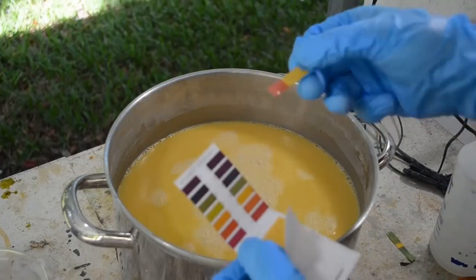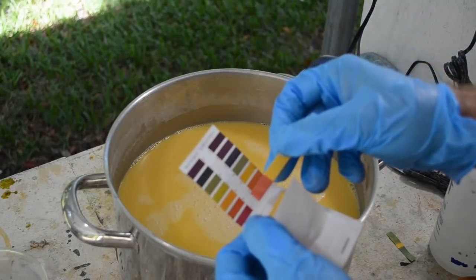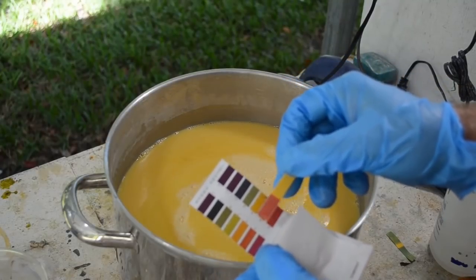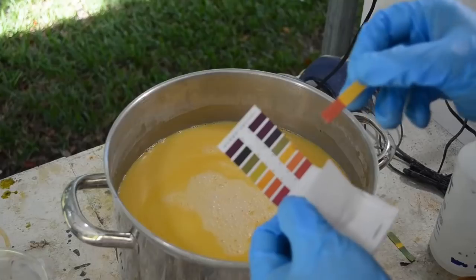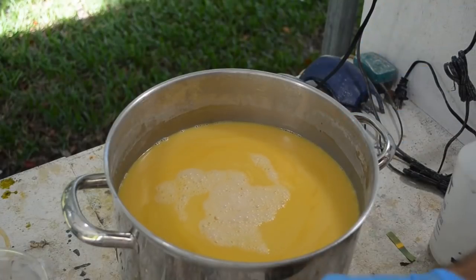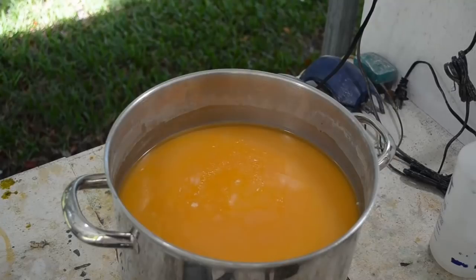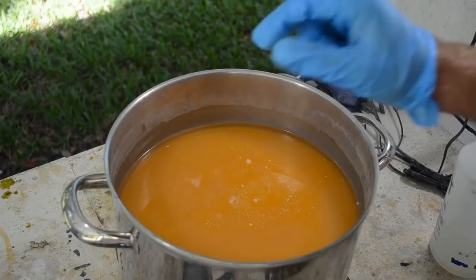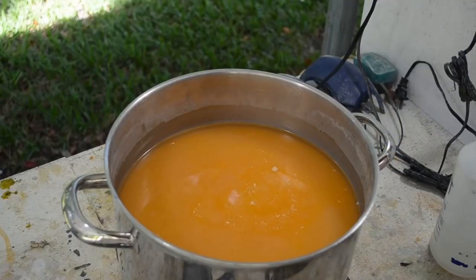Let's check the pH. I would say that is between 3 and 2. So I'm calling that 2.5. That's pretty good. So now it's time to add the zinc. I don't know what that precipitate is, but I can already see it settling. There's a layer of clear liquid about that thick over the top of it as it's slowly settling down.